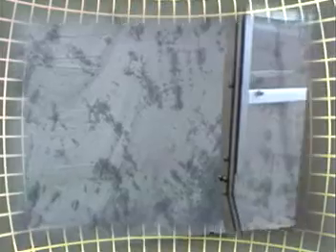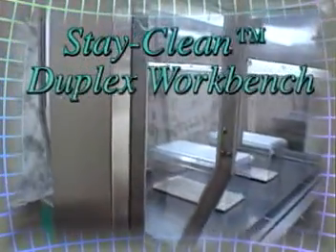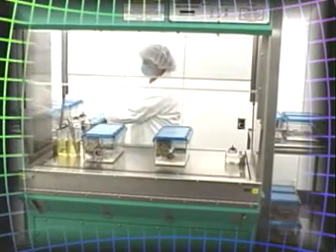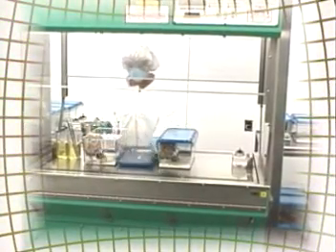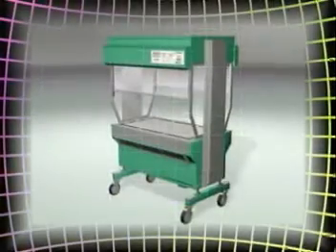What's new in Class 100 workbenches? The Stay Clean Duplex workbench provides a Class 100 HEPA filtered environment that is 99.99% efficient to 0.3 microns. When used with proper aseptic technique, the Duplex workbench substantially reduces the risk of cross-contamination and allergen exposure during routine animal manipulations and cage change procedures.